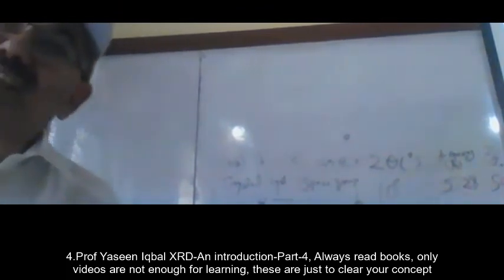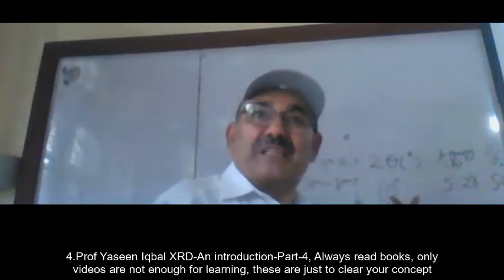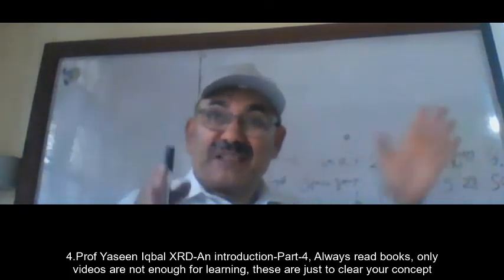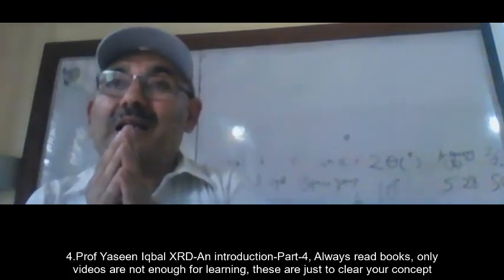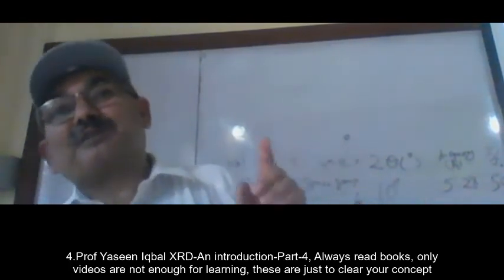You reciprocated the angstrom dimension spacings into millimeters and centimeters. The smaller the difference between two planes within the crystal, the larger will be R, the reciprocal lattice spacing. And the larger the d spacing, the smaller will be this. So we need to convert smaller into larger, and that is why we are reciprocating things, right?